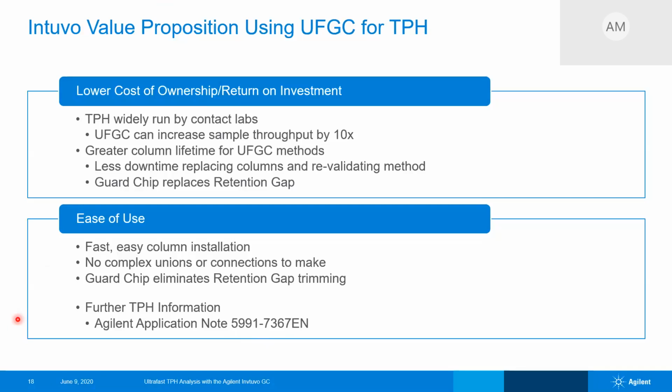Yeah, Intuvo could certainly be used to do that, but not with this method. As you saw, in this method we're extracting our samples with heptane. And in the Texas method, which is used by a number of different states, as you pointed out, we need to get down to C6. So that heptane wouldn't be an appropriate solvent. Typically, something like methylene chloride or pentane is used.